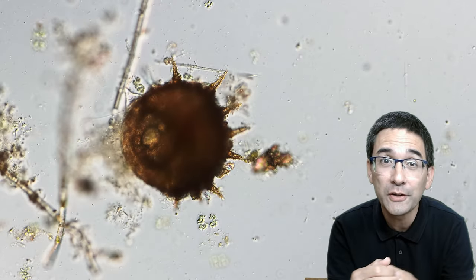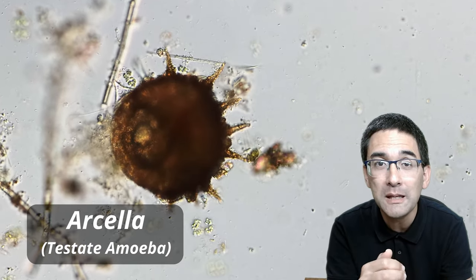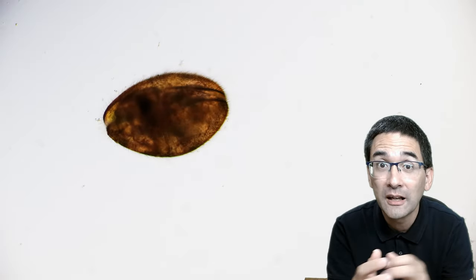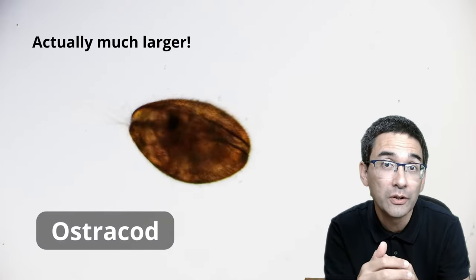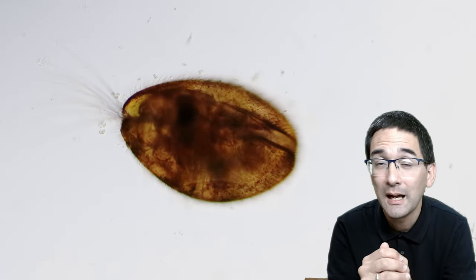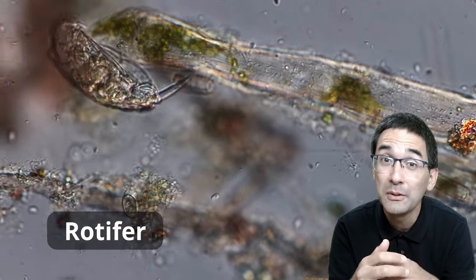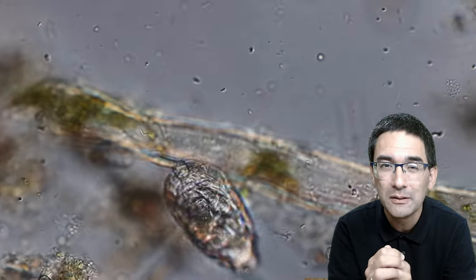This one over here is also very common and is a so-called test — a test is a shell of an amoeba. Amoeba are single-celled protists that are able to change their shape. Slightly larger are the so-called ostracods, which belong to the crustaceans — they're related to crabs. Other multicellular organisms found are rotifers, though I didn't find so many of those because unfortunately many had already died out as the sample was a little too old.